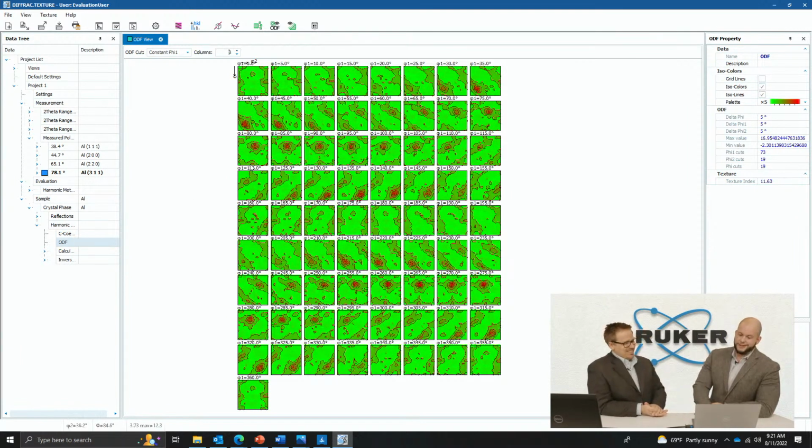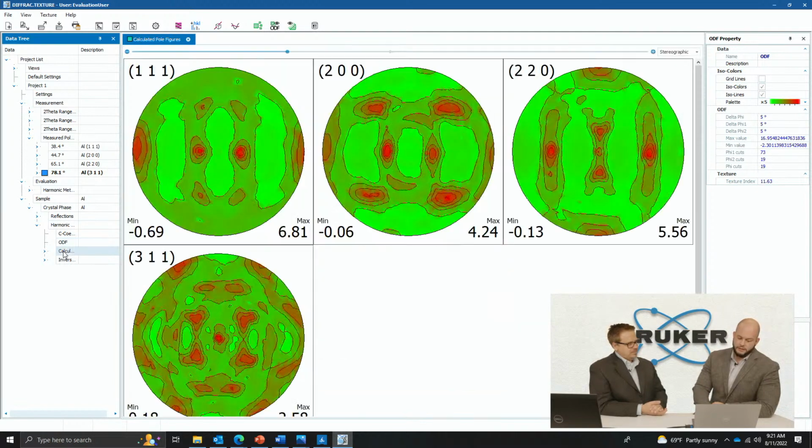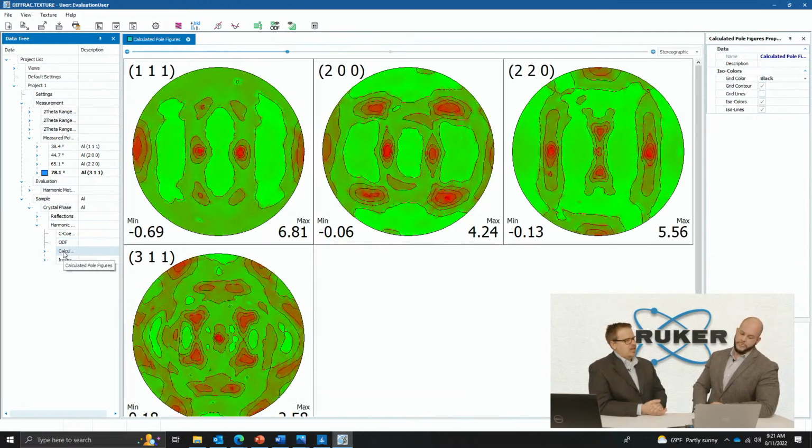So does this mean something? It does. We have a few spherical components here, and what this allows you to do is basically characterize the total orientation of the crystallites in the sample. From this, we can actually calculate new pole figures. And you can see, based on the fitting, we were able to fill in the regions and create our complete pole figures.